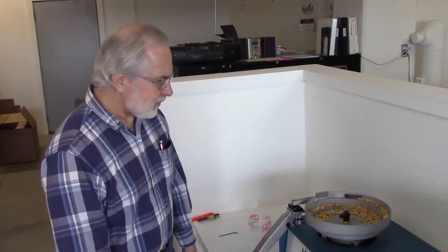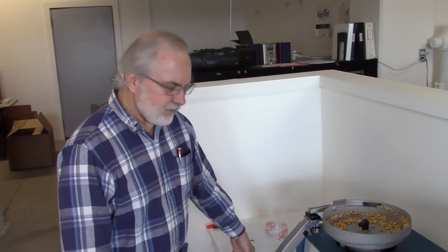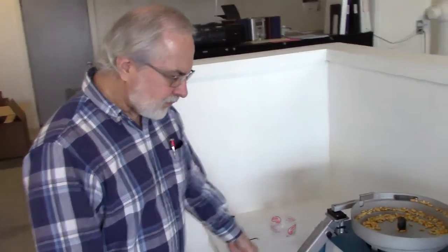This video is going to show how to totalize the count on the Model 948 KeyMat seed counter. And to help us through this is Jim Kopak, who's going to demonstrate the process. Okay, take it away, Jim.